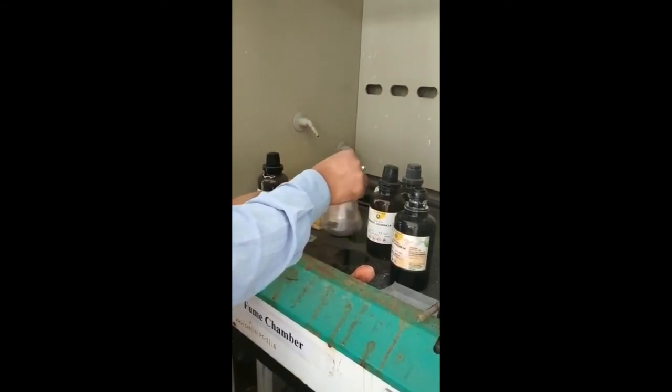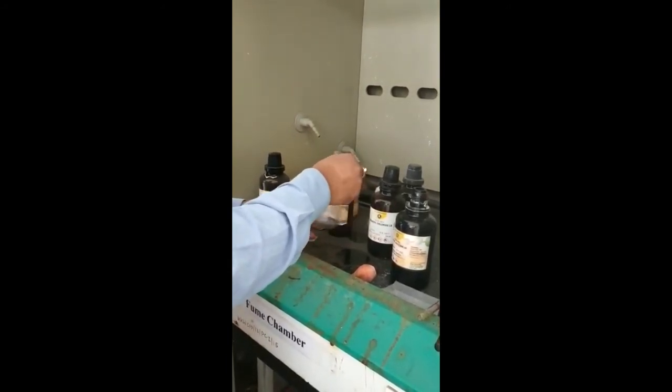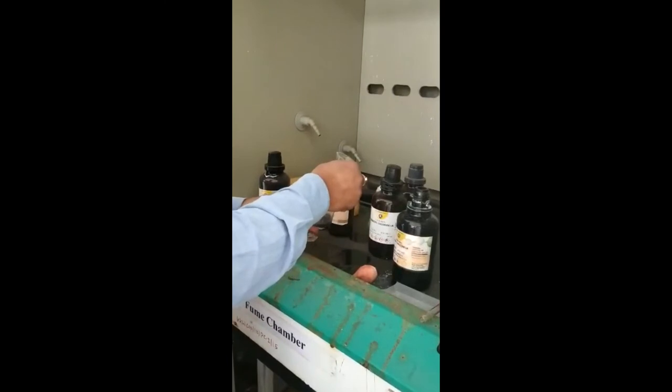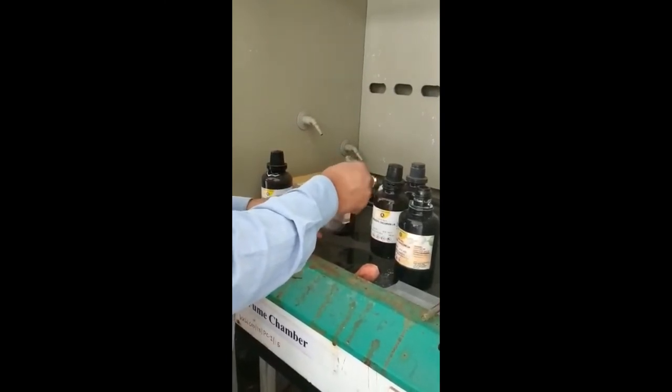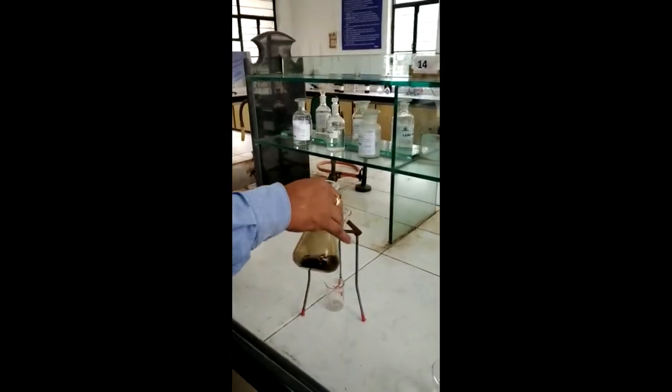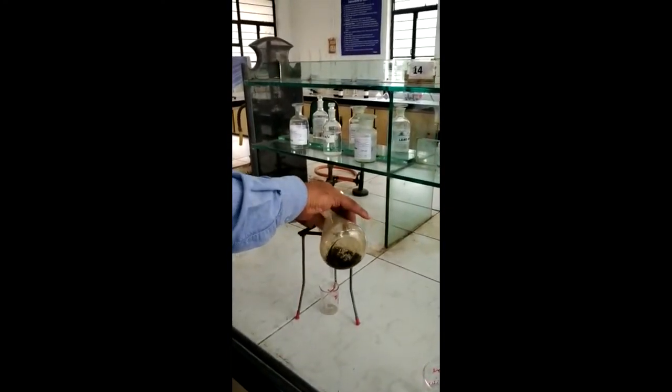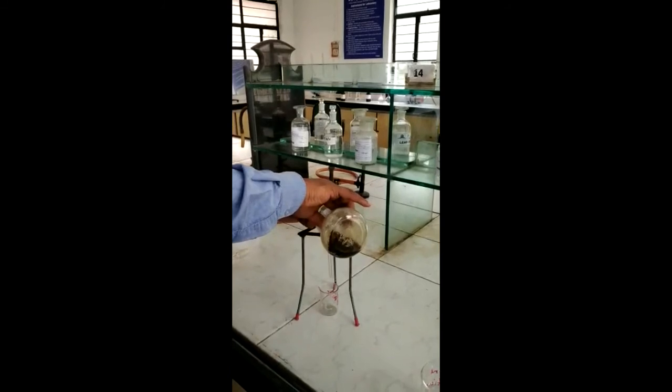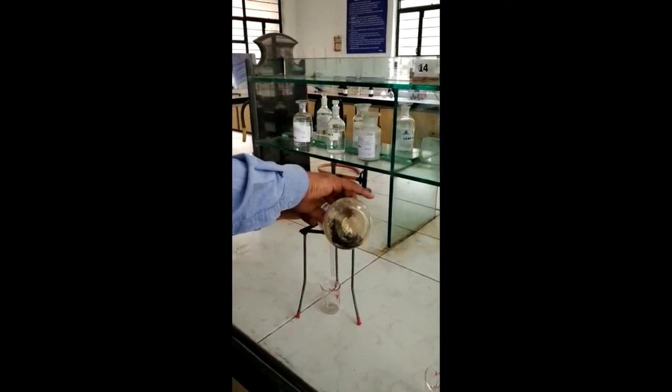For 10-15 minutes you get the precipitate of derivative of phenol, that is phenyl benzoate. After shaking you get the precipitate of derivative of phenol. Filter it off.